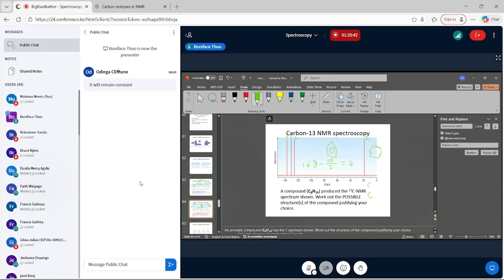So let's now think about what kind of substitution would give us the ratio of the aromatic carbons to be in the ratio of 2 to 2. Okay, is it a single substitution, a double substitution? And if it is double, using these alkyl carbons, then what are the relative positions of those substitutions?